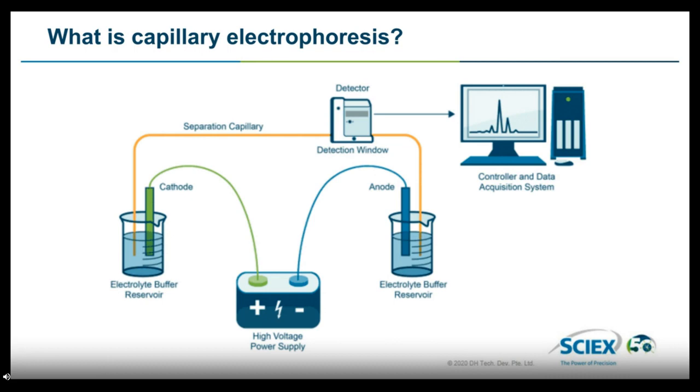And this is shown in the next slide, and again, this cartoon. So basically, the capillary in CE sits in two buffer reservoirs of electrolytes. So you fill the capillary with electrolyte solution. And then you have a cathode and anode at either end of the capillary, and then you apply a voltage, and what happens is the peaks migrate through the capillary, and they pass through a detector window. And those detectors could be UV, PDA, or laser-induced fluorescence detection.